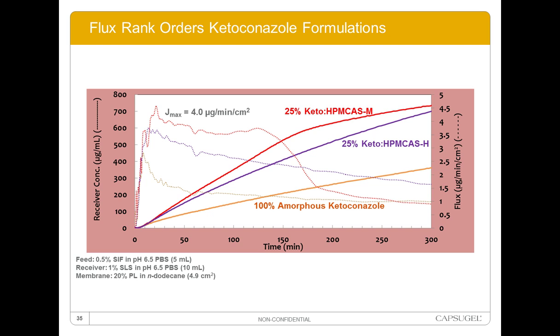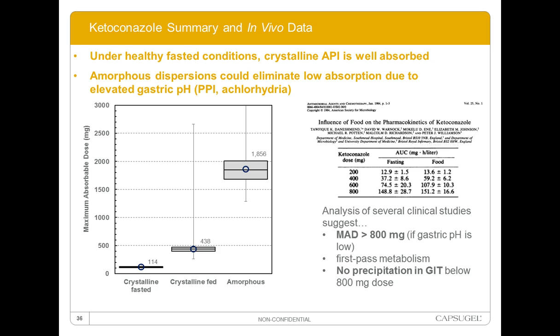One reason for this may be that this is not truly all free drug that we're measuring in the dissolution test, and that's why this membrane test can be really valuable for comparing formulations where a dissolution test may be a little bit misleading, and the apparent concentration may not be straightforward to compare between formulations.